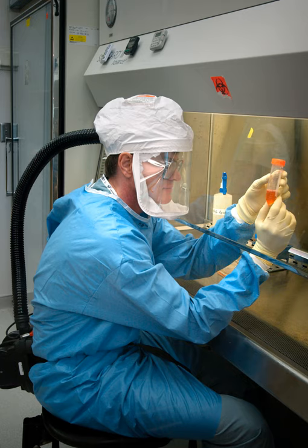Type B1 cabinets split the airflow so that the air behind the smoke split is directed to the exhaust system, while air between the operator and the smoke split mixes with inflow air and is recirculated as downflow. Since exhaust air is drawn from the rear grille, the CDC advises that work with hazardous chemistry be conducted in the rear of the cabinet.